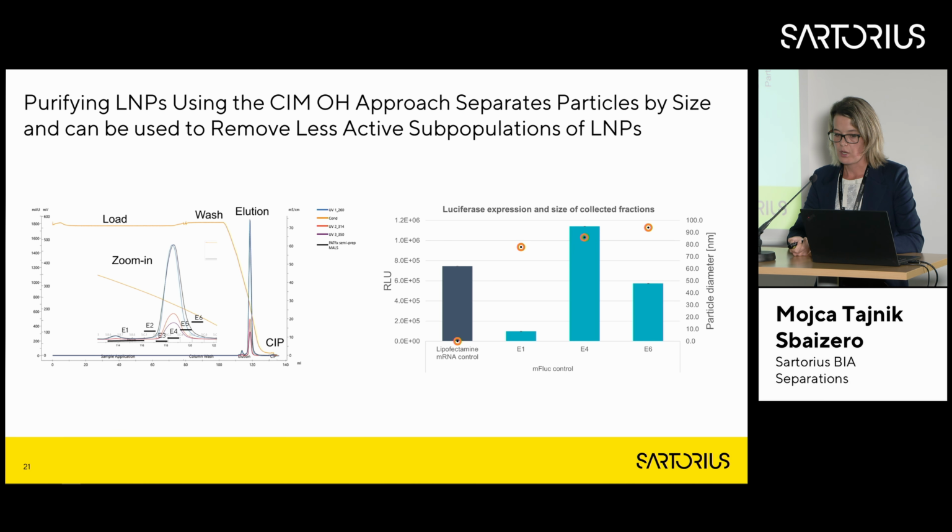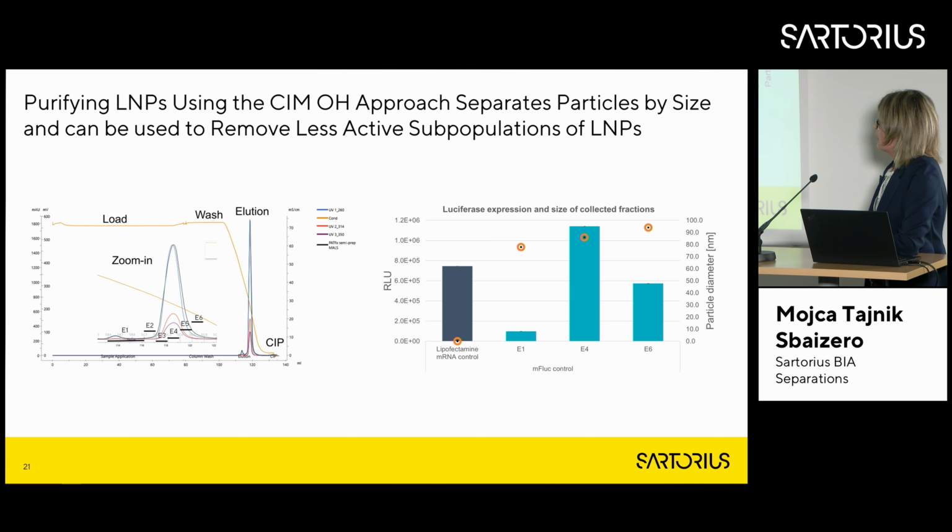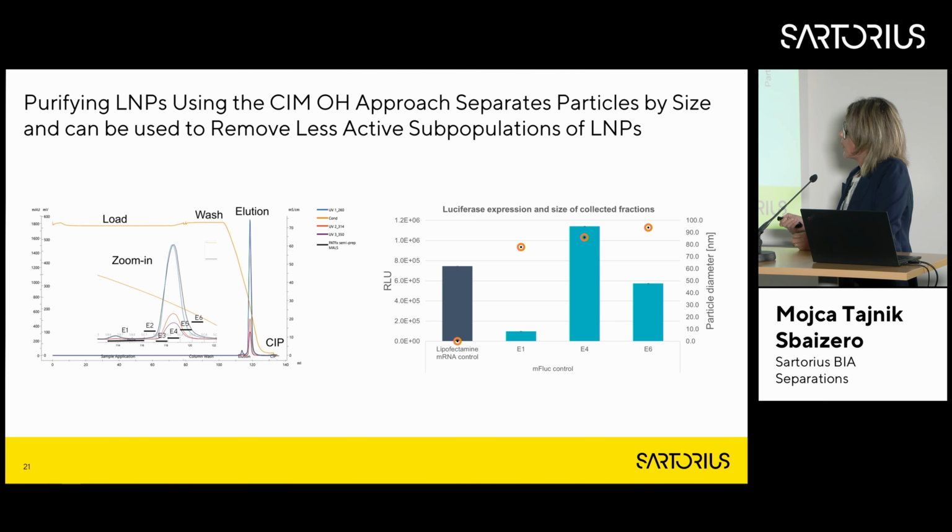When we talk about chromatography, it's not only about concentrating and removal, but it's also about the separation. So we see here, for example, in the process development, we fractionated the peak of the LNPs into several subpopulations, and we analyzed them for the luciferase expression and sizing. We could see that the first and the last fraction that we're showing here were less active than the central fraction.